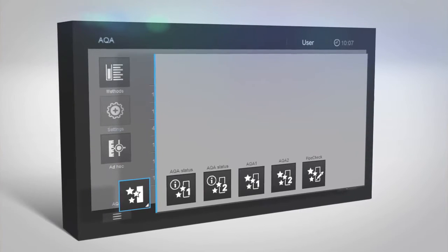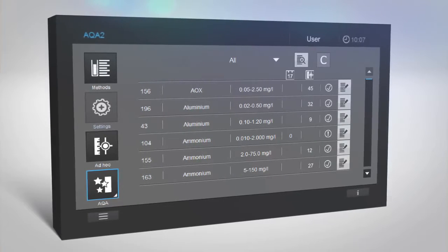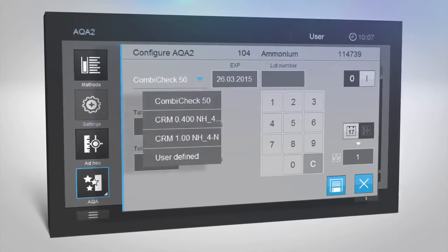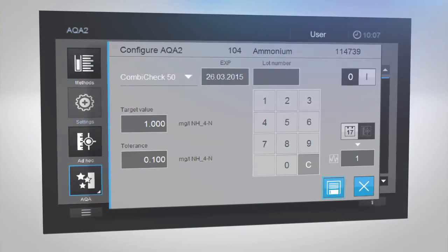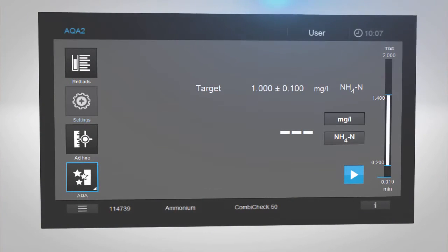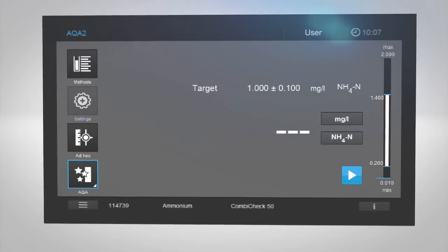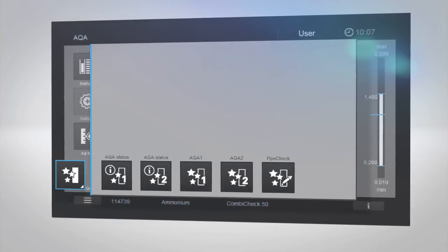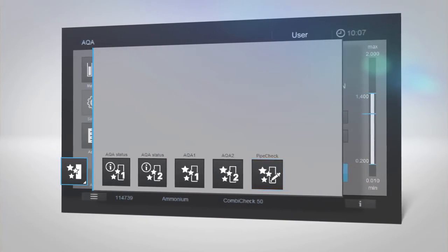Combi-Check allows you to test the status of your whole system. To perform this check, go to the AQA menu, tap AQA2 and select your desired method from the list. In this example, we select Ammonium. You will be given instructions about which Combi-Check standard solution to use. Please adapt the target values according to the Combi-Check package insert and click Save. A single measurement using the R1 solution will tell you whether your system is working correctly. Prepare your measurement as usual, but use the standard solution instead of your sample. Insert the cuvette and the measurement will start. The instrument will show you immediately whether you achieved the target concentration or not. If your results are outside the target concentration range, you can test the accuracy of your pipette measurements using the pipette check. This test is also instrument-supported and pre-programmed.